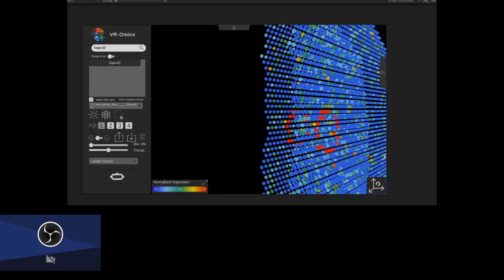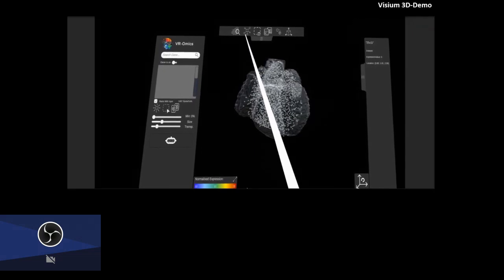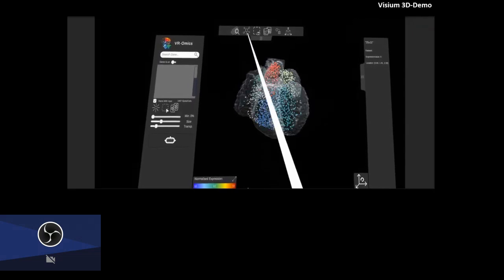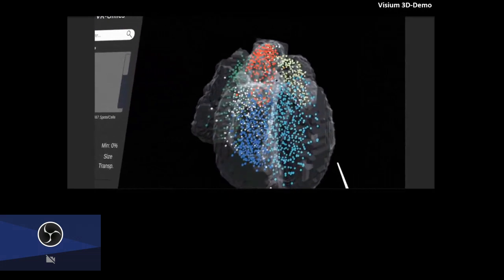So in the beginning, I told you that we have virtual reality capabilities as well. At any given point, you can use the software as a virtual reality environment if you want to. You just pop on the headset and press the button, and it will automatically switch into VR mode, which means everything I showed you is also available in VR. Just to show you how it looks, here's the data set from the beginning as a VR environment, which might be really helpful if you want to dig in and interact with the data in more detail.